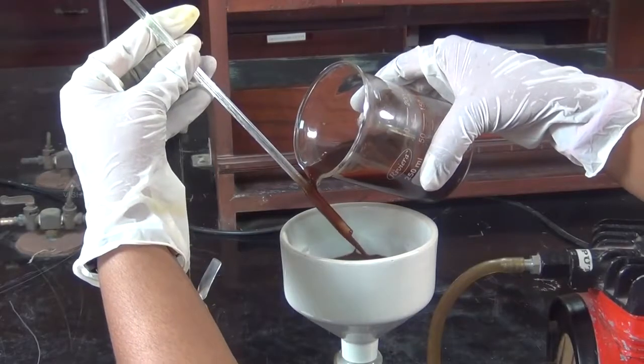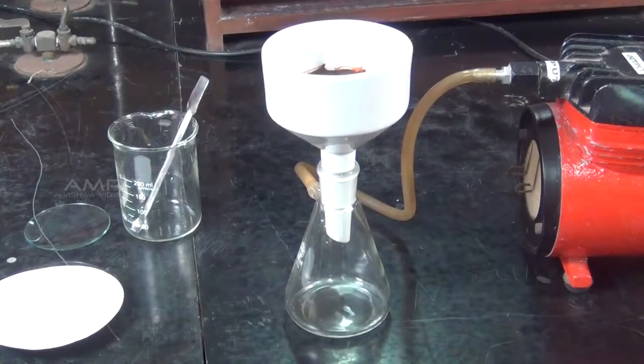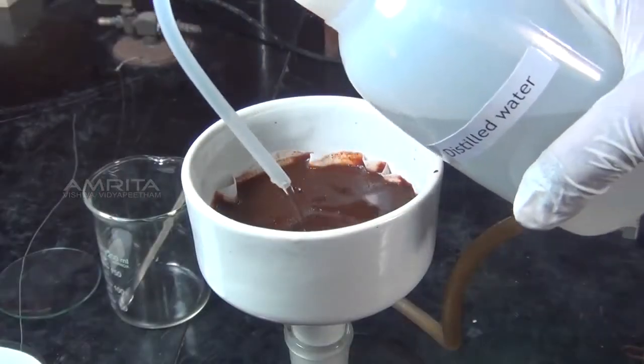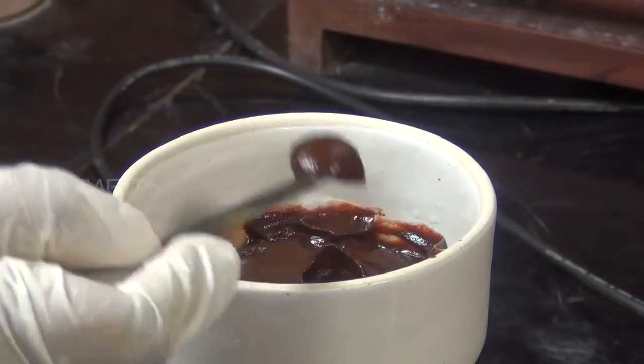Filter the precipitate of ferric hydroxide so formed through a Buchner funnel. Wash the precipitate with distilled water and transfer it into a watch glass.